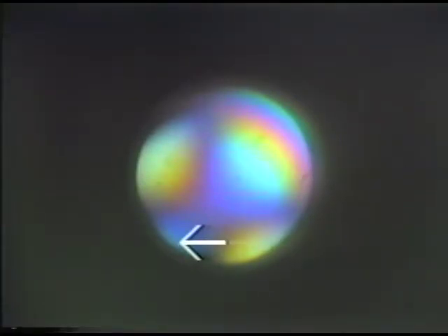When we obtain a centered optic axis figure, we can directly determine the sign of the mineral by using the accessory plate. And so I'm going to take the accessory plate now and insert it into the accessory slot and look again at the centered optic axis figure. And now you can see that for the mineral quartz, in the northeast and southwest quadrants of this particular figure, we see, with the gypsum plate, a blue color. And in the northwest and southeast quadrants, we see a yellow color.